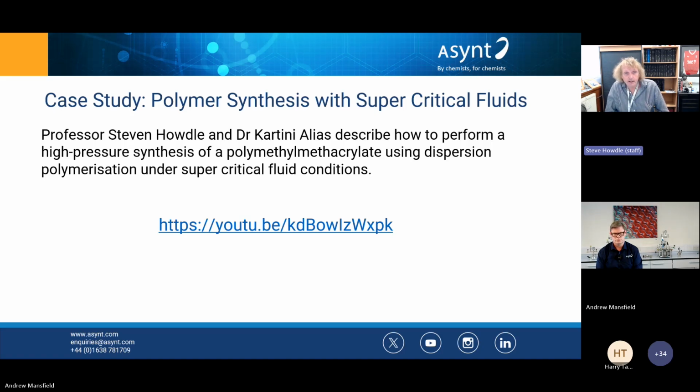So the vessels that we use in our group, we have about 35 of them in our laboratory, and they're used by all of the researchers in our labs. We have research visitors who come in and use them. We have undergraduate students doing projects who use the vessels, and all of these are done after each individual has been trained and we actually have a high pressure course that all of our individuals undergo to make sure they understand all of the issues around high pressure. That's something else you might want to consider about how you handle the logistics around safety training.